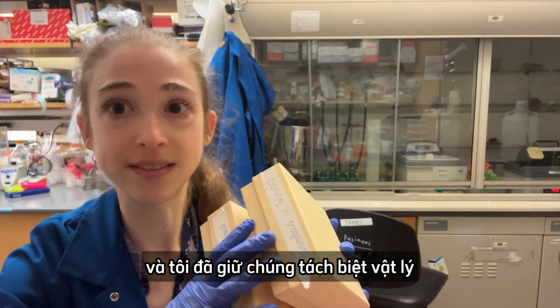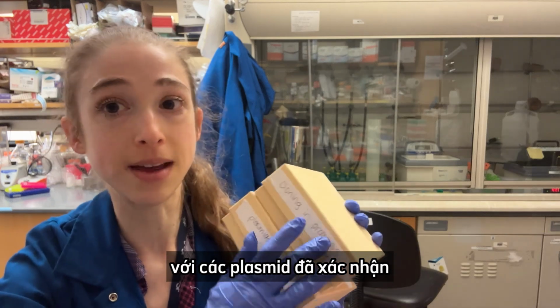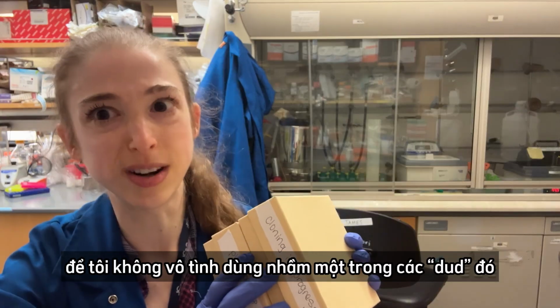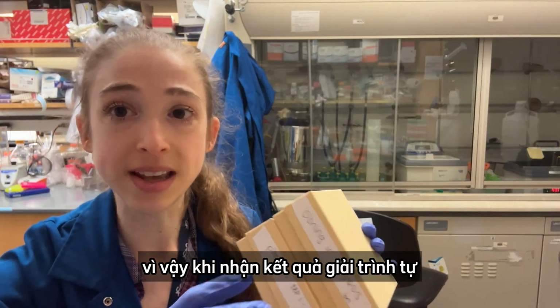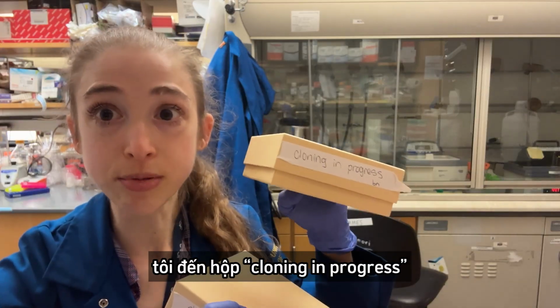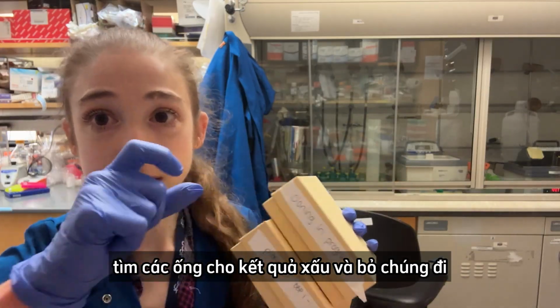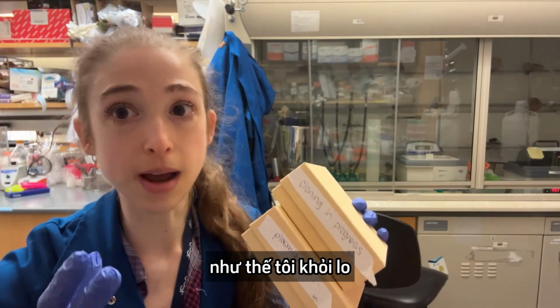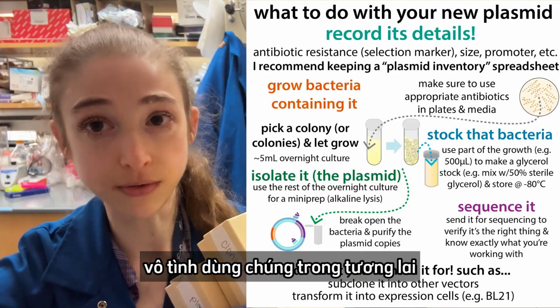And it was a good thing that I kept them physically separate from my verified plasmids so that I don't then go and accidentally use one of those duds. So when I get the sequencing results back, I go to my cloning in progress box, and I find those tubes that were the bad ones, and I toss them. This way, I don't have to worry about accidentally using them in the future.